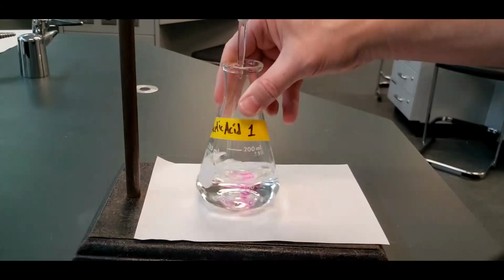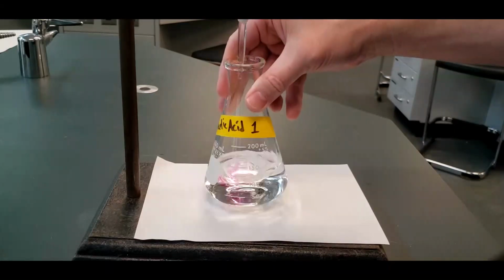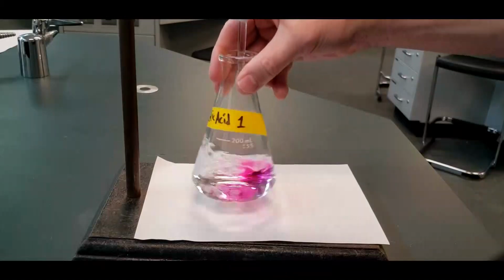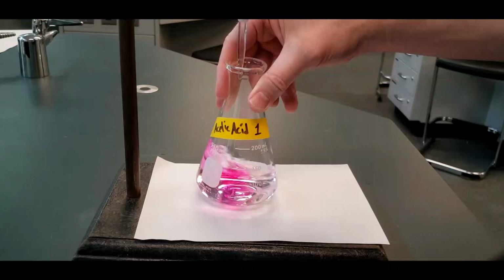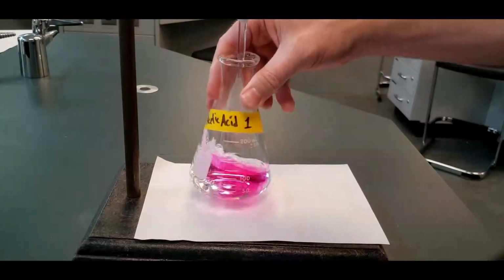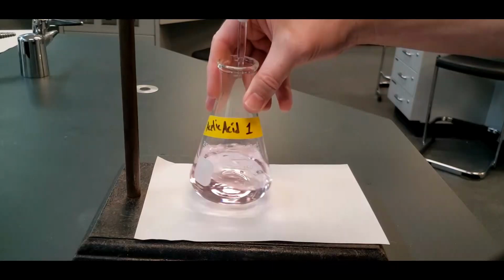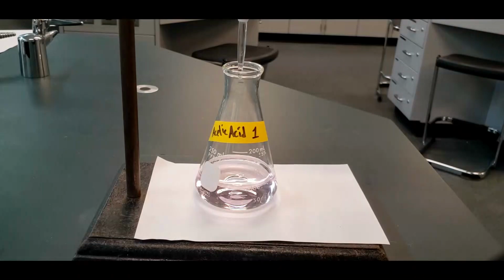This is just so you can see that each of these different acids does the same thing. And the acetic acid, for the report sheet, you'll be asked to do some further calculations with it. Whoops. Did I? Nope, you can see we're very close there. Even when it's all gone, there's a slight sheen there.